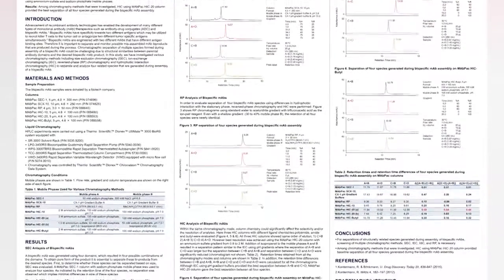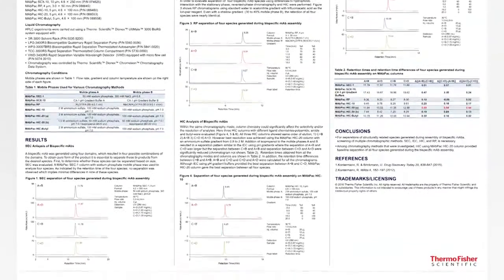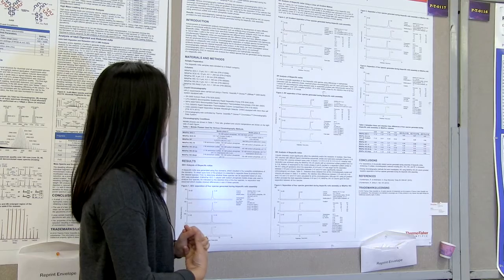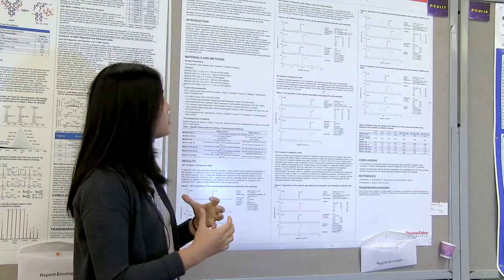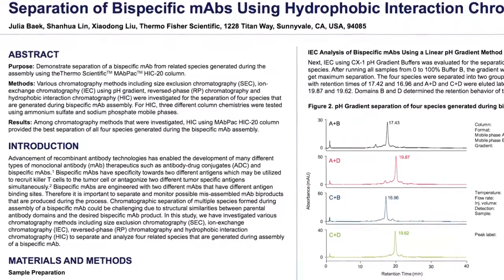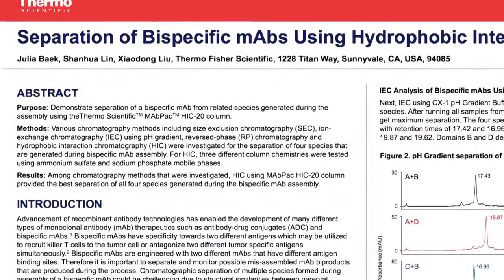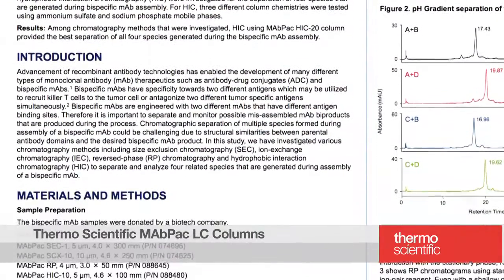We got the sample from a local biopharmaceutical company, and they wanted us to figure out which mode might work the best, or which column would separate this sample the best. The sample is a bispecific monoclonal antibody, so it's actually assembled from different, probably heavy chains or light chains. We actually don't know the exact information of the sample, and they wanted to separate all of these forms for their purification or analysis. So here we tested a lot of our mAbPac columns.